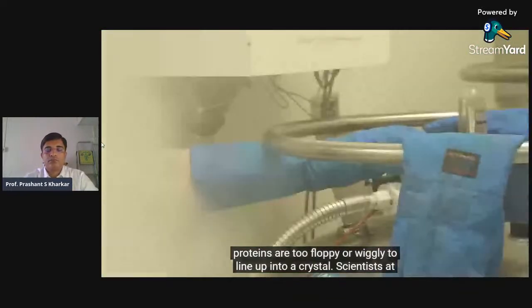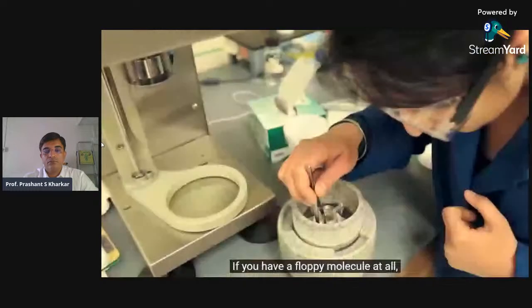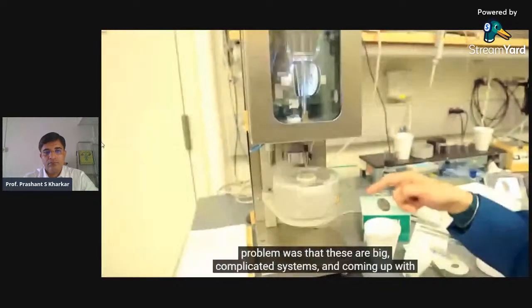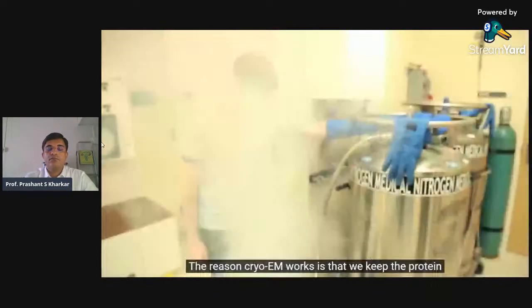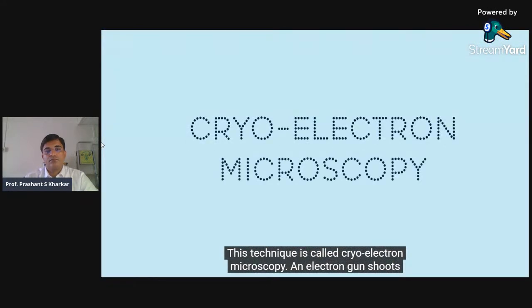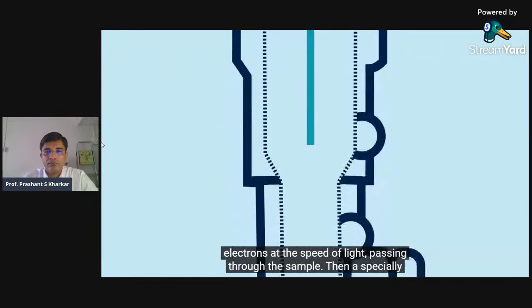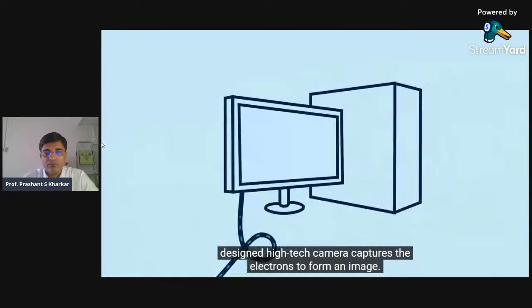Scientists at UCSF have developed a better way to view these elusive proteins. If you have a floppy molecule at all, they just become more and more challenging to crystallize. Really, the problem was that these are big, complicated systems, and coming up with new ways of studying them required thinking about electron microscopy. The reason cryo-EM works is that we keep the protein in a very thin layer of liquid, and we freeze them. This technique is called cryoelectron microscopy. An electron gun shoots electrons at the speed of light passing through the sample. Then a specially designed high-tech camera captures the electrons to form an image.